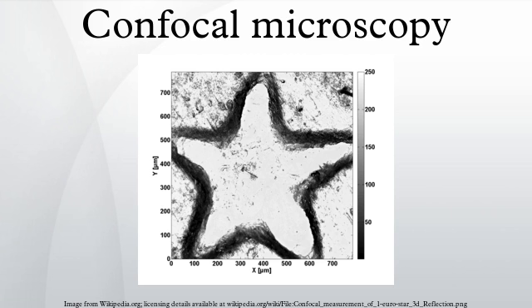Cutting-edge development of confocal laser scanning microscopy now allows better than standard video rate imaging by using multiple microelectromechanical scanning mirrors. Confocal X-ray fluorescence imaging is a newer technique that allows control over depth, in addition to horizontal and vertical aiming, for example, when analyzing buried layers in a painting. Variants and enhancements: improving axial resolution.